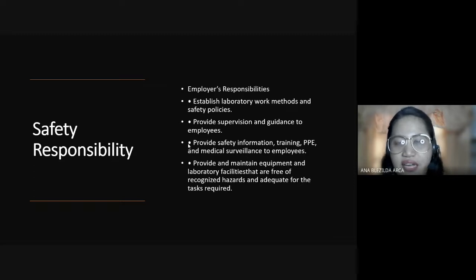Hazard yan. Kasi nga naman, konti lang yung staff mo, kapag konti lang sila, na-stress sila, prone sila sa error. Pwede sila magkamali. 'Di ba? So, pwede magkaroon ng aksidente doon sa laboratory kapag ganun ang nangyayari. Okay? So, yun ang example ng mga responsibility ng mga employers. Besides that, they're also responsible to provide guidance and supervision.